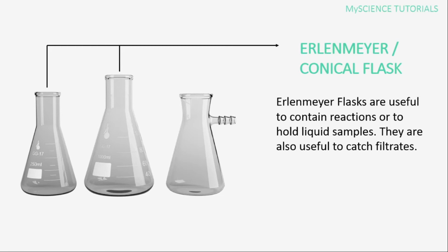When you're adding in, you need to be shaking. If you are using a beaker, the shaking becomes difficult, but with the conical flask you can easily shake, so that your acid and base will mix with each other and then you can get your endpoint faster.